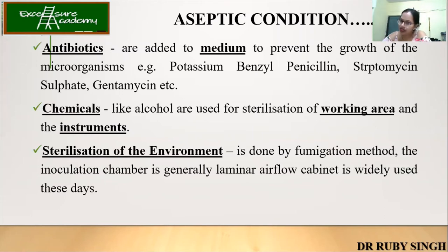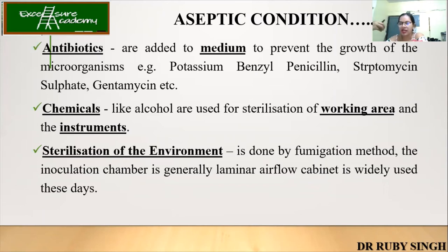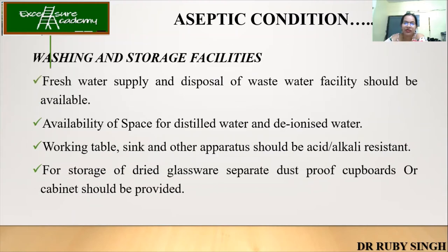Once everything has been done, again sterilize with 70% alcohol, wipe your hand, close the hood, and it's done. Sterilization of the environment is done by fumigation method. The inoculation chamber — generally a laminar airflow cabinet — is widely used. Fumigation is done in most labs to prevent contamination in the hood itself from outside air. It is advisable that your lab should undergo fumigation once a week.